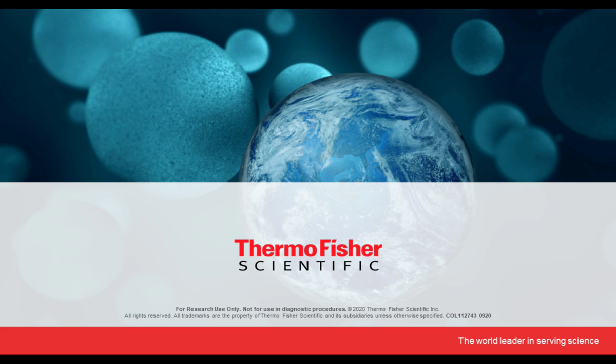Yeah, so I think that's another great question, right? It really depends on your particular experiment. For example, there are experiments where researchers are comparing differences between a phosphoprotein and a non-phosphoprotein after treatment with an agent that triggers phosphorylation.